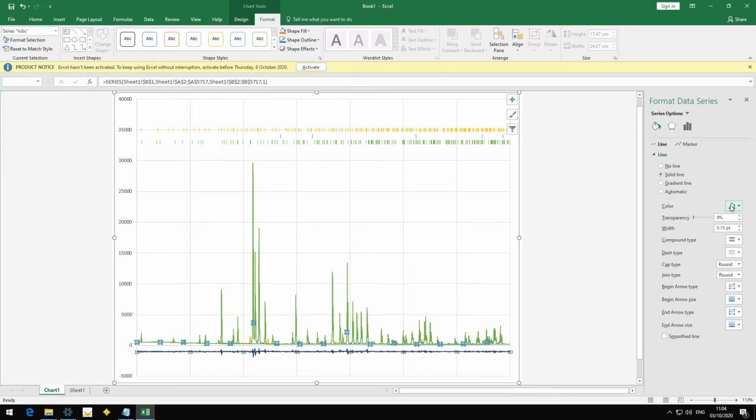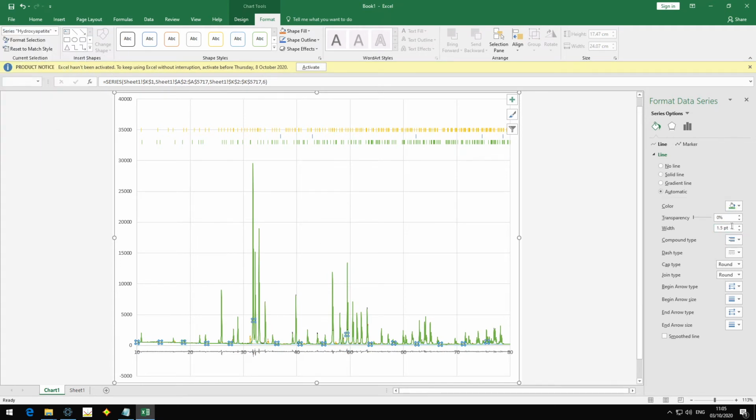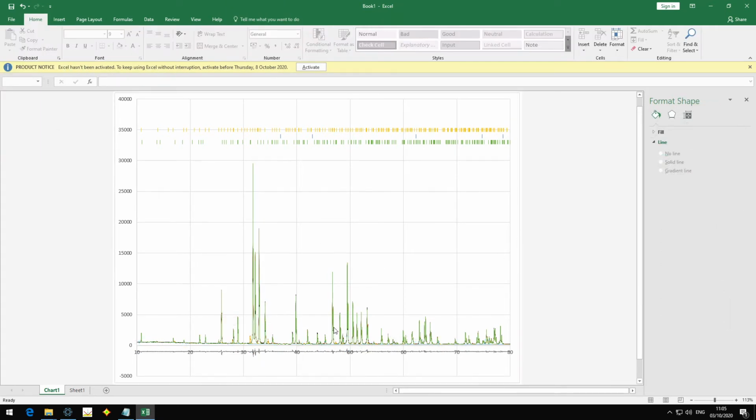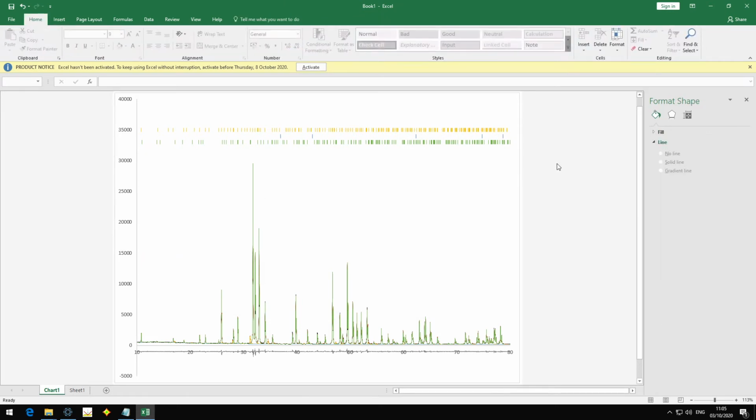I will reduce the line width of each series. I also want to use our standard colors. So I want to use black for Iobs, plain red for Icalc. Then we have background, it's usually blue, and the difference curve gray. Okay, now we can actually recognize the noise pattern and things like that. I also want to get rid of this grid.